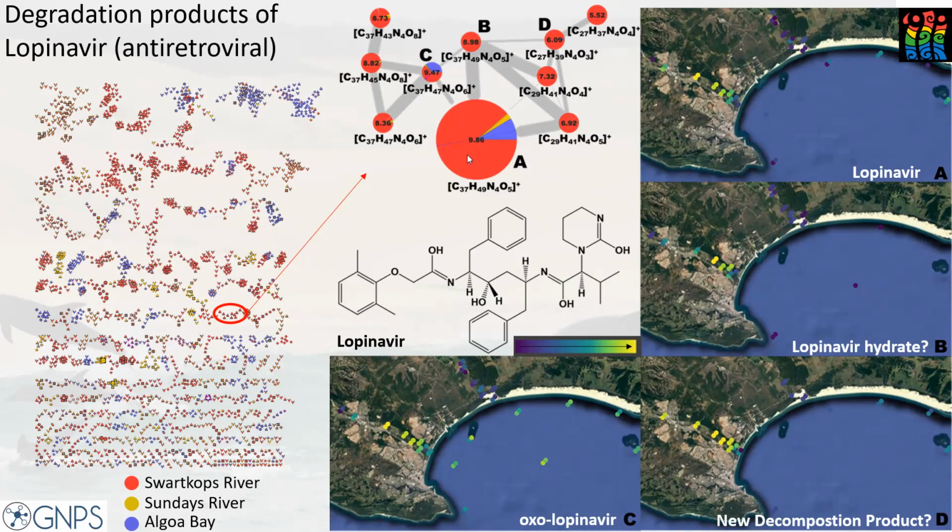They actually produce near identical fragmentation spectrum, same mass, but then when I looked at the XIC, the extracted chromatogram, I could see that both of these features are actually distinct. They're distinct peaks, so they're real chromatographic features we're observing. And then I theorized what might be going on there. Then when I looked at the map here, I could see that one of the features occurs later downstream of the other one.